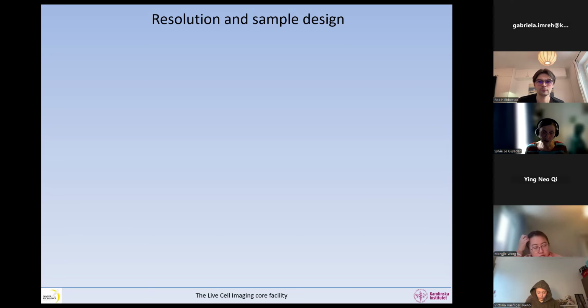So we have one size of pinhole per image. And there, the manufacturer has to decide, am I going to calculate the pinhole size when you click on one Airy unit? Is this going to apply to, let's say, if I have three different fluorophores, the short wavelength or the long wavelength or the middle wavelength? Yeah. So there is a default for each manufacturing company, and you can change it.